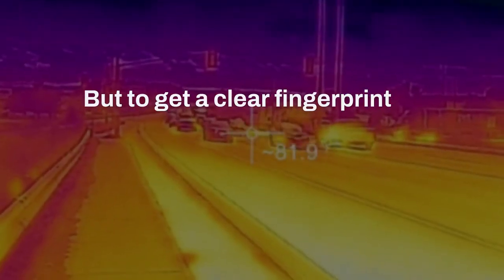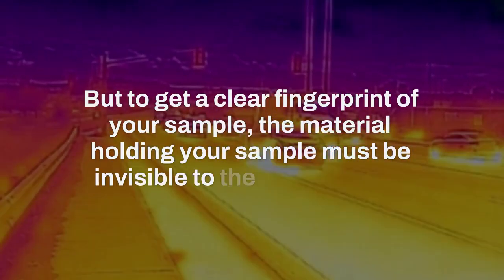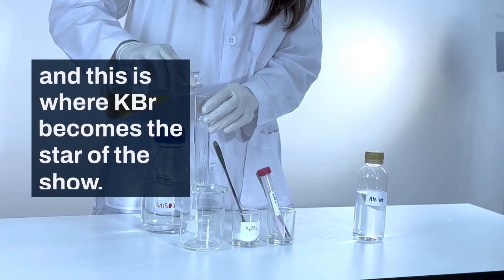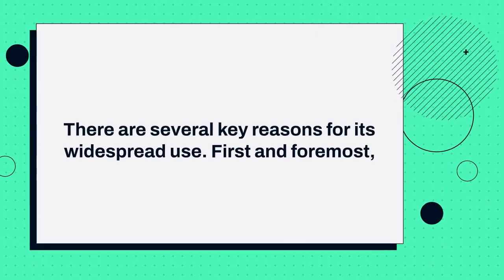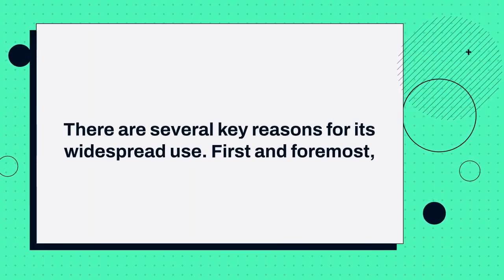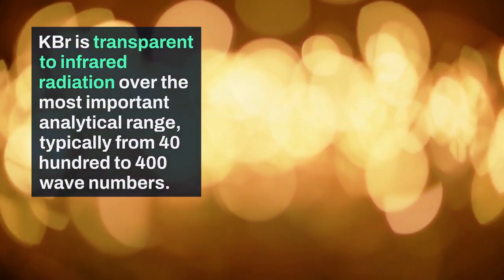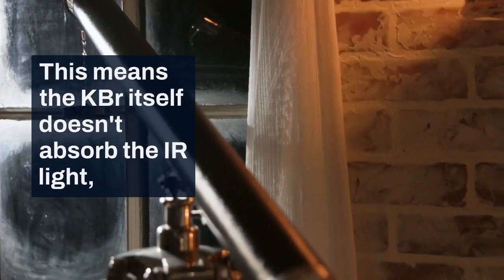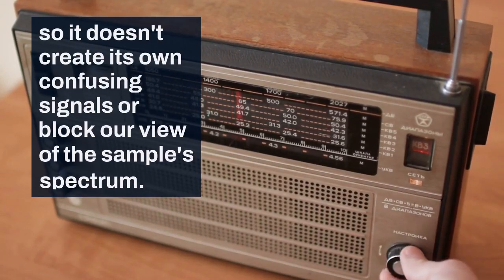But to get a clear fingerprint of your sample, the material holding your sample must be invisible to the infrared light, and this is where KBr becomes the star of the show. There are several key reasons for its widespread use. First and foremost, KBr is transparent to infrared radiation over the most important analytical range, typically from 4000 to 400 wave numbers. This means the KBr itself doesn't absorb the IR light, so it doesn't create its own confusing signals or block our view of the sample spectrum.